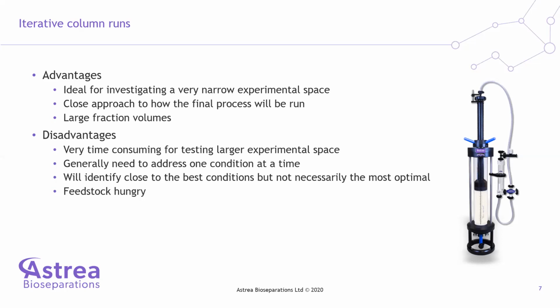This approach is also very close to how your final process is going to be, as it's run in a controlled column. This approach gives you large fraction volumes, which means that you don't need to limit the amount of analysis or pick and choose which tests you're running, especially if you've got any tests that need concentration and require a slightly larger volume.